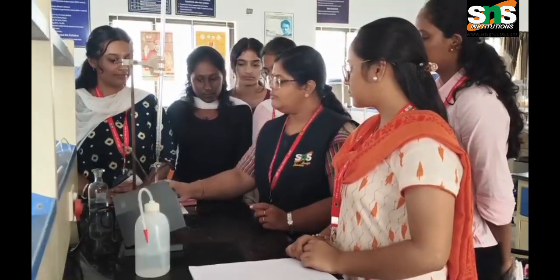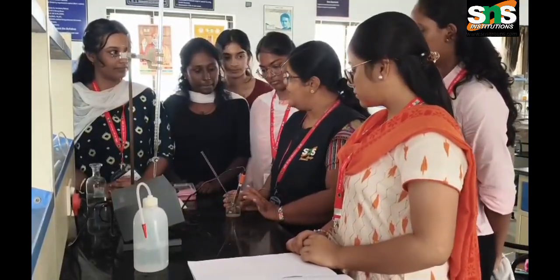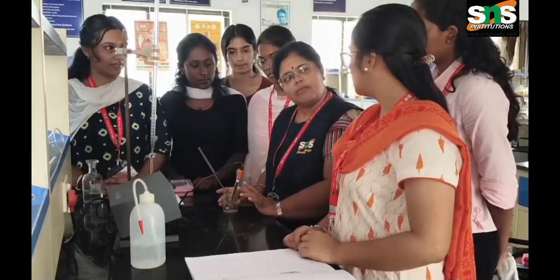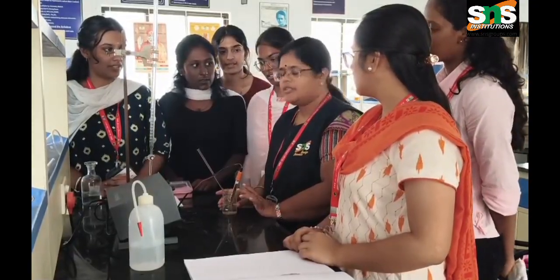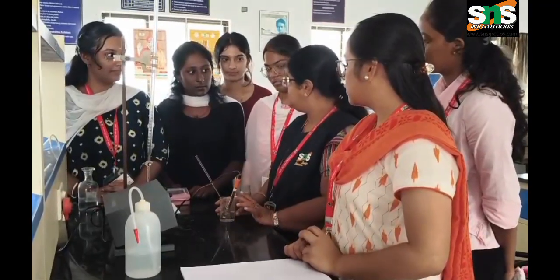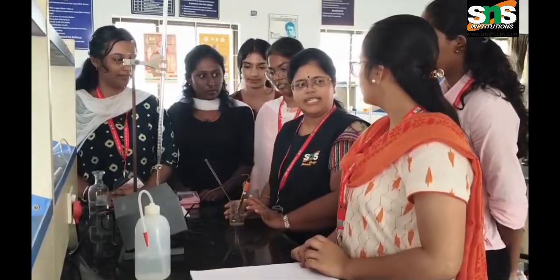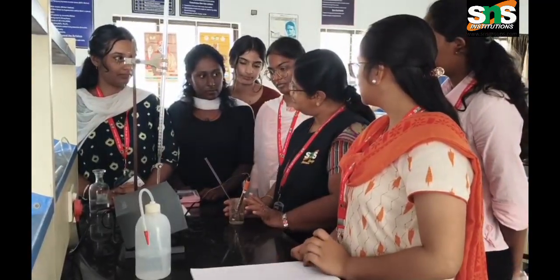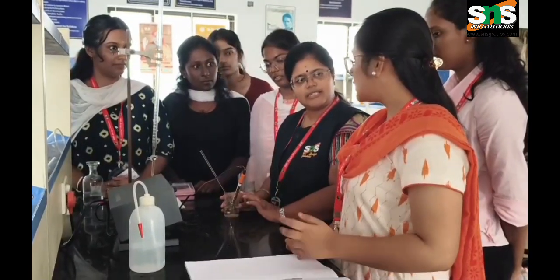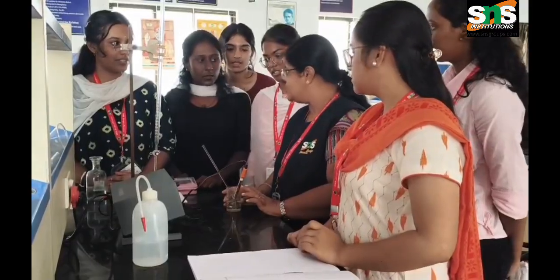Here, a mixture of acid solution is taken in the beaker. We have two different acids: hydrochloric acid and acetic acid. What type of acid is hydrochloric acid? Strong acid. How do you say it's a strong acid? Because it gets completely dissociated in the solution. What type of acid is acetic acid? Weak acid. Why? Because it gets partially dissociated in solution.